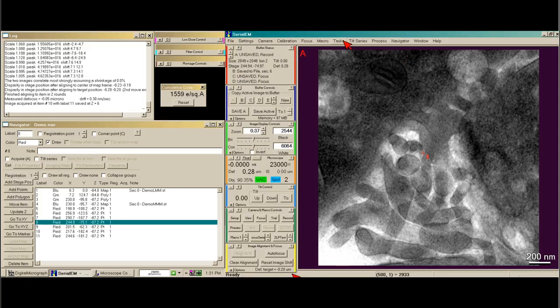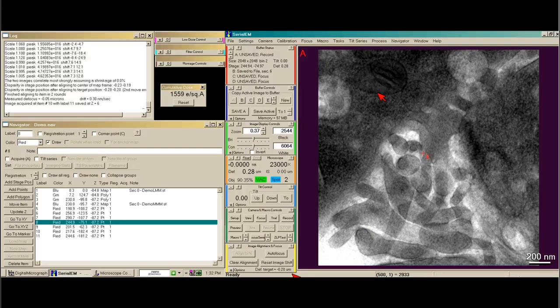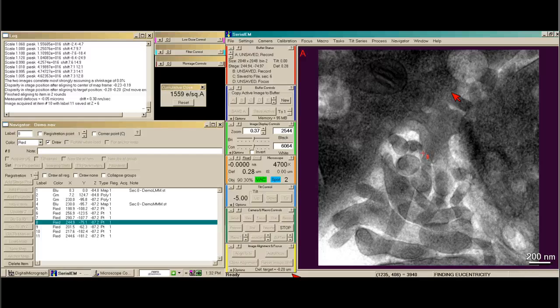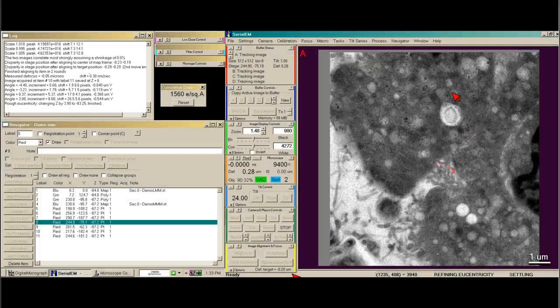The next thing I want to do is eucentricity. I want to make sure that we're really good and eucentric at this position on the grid. I'm going to do not rough eucentricity and not fine, but both. What this will do is go down to 4,700X for rough eucentricity and take a series of tilted images from minus 5 to 5 degrees and cross-correlate them to adjust the Z height. Rough eucentricity has finished, and we're going to do fine eucentricity.